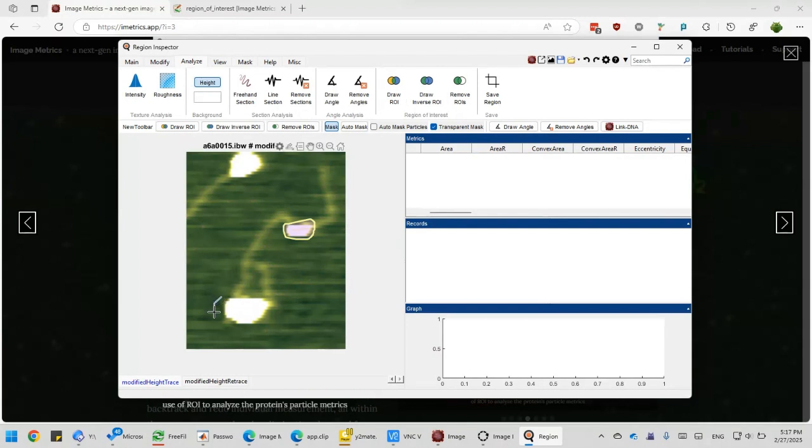Here I'm going to show you a bit of a trick that sometimes is good to know. So for example, if I draw the region of interest this way, I'm not drawing this very precisely. All right. So for you to see the masking better, I can turn off the transparency of the mask. So you see that the mask is restricted within our region of interests.